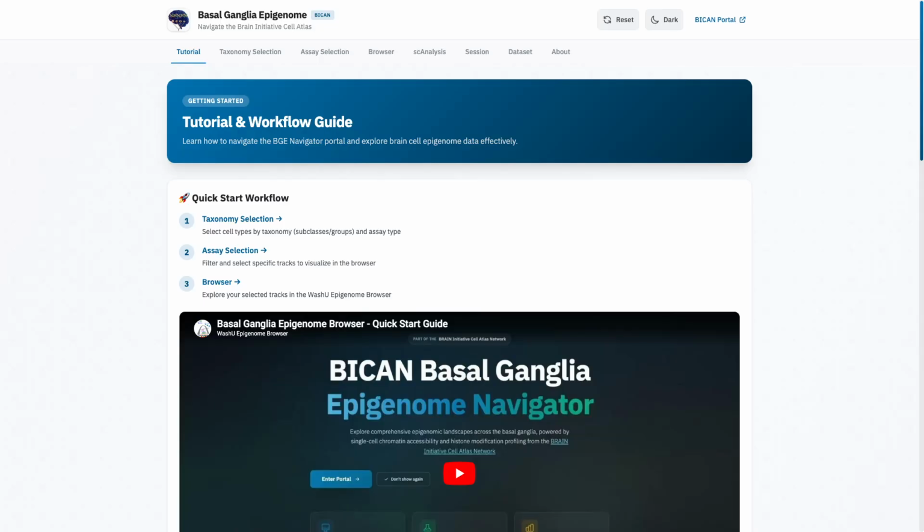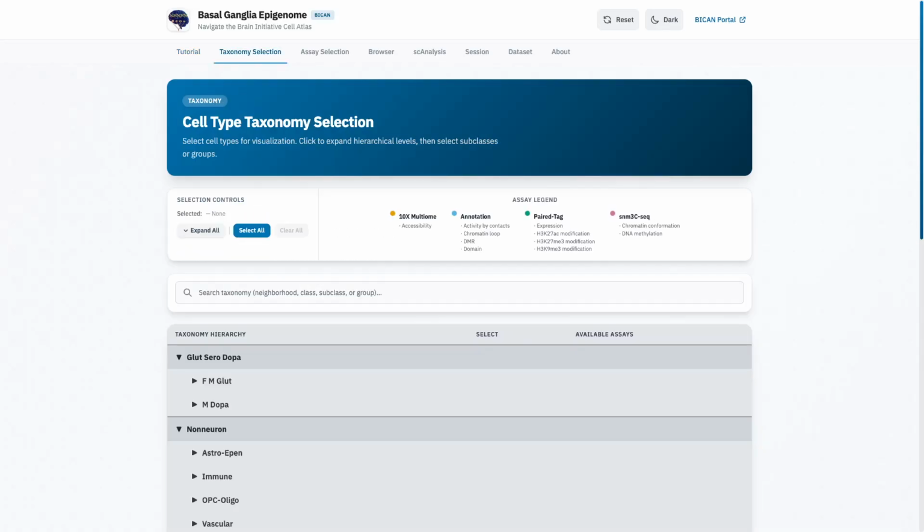In this video, we're going to do a deep dive into the Taxonomy selection tab. This is where your analysis journey starts. You will learn how to navigate the cell type hierarchy, understand the assay indicators, use the search function, and explore region distribution charts. Let's get into it.